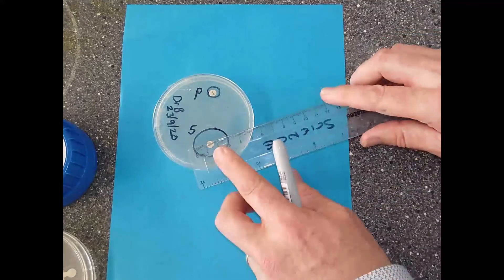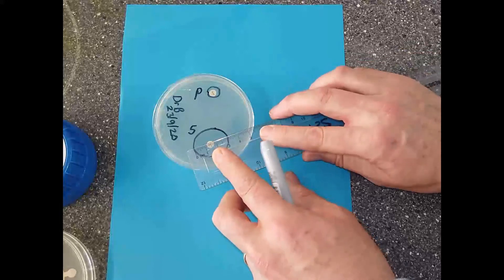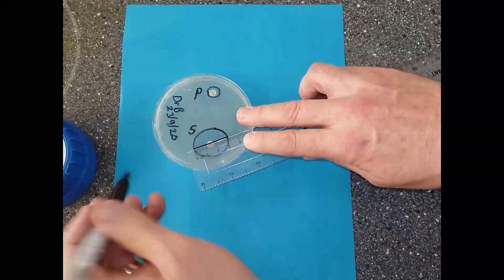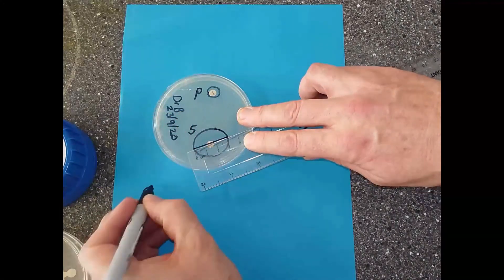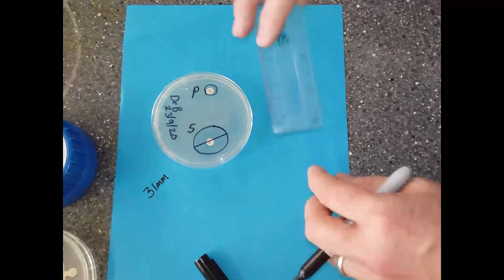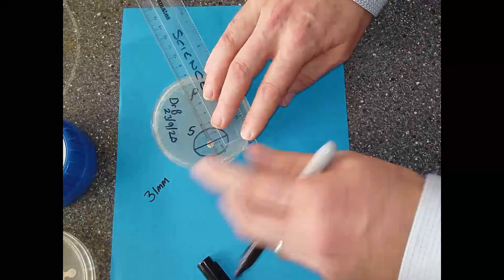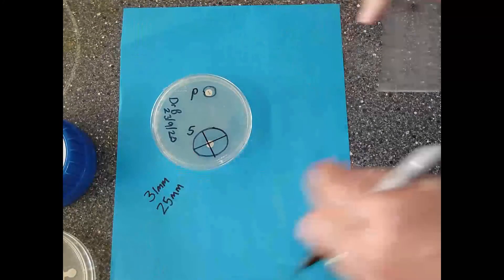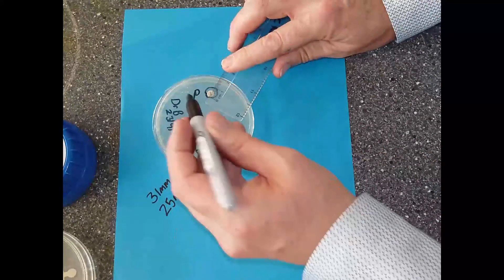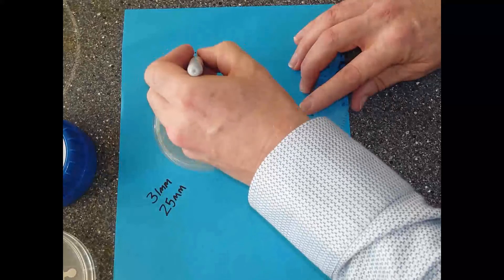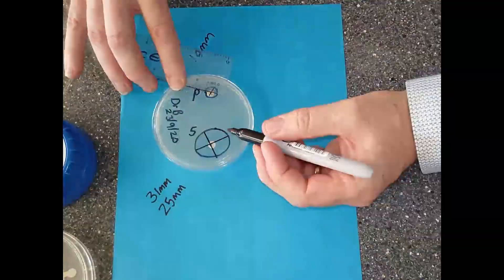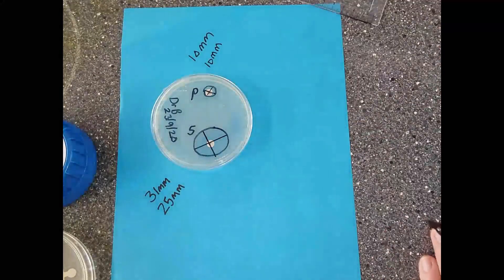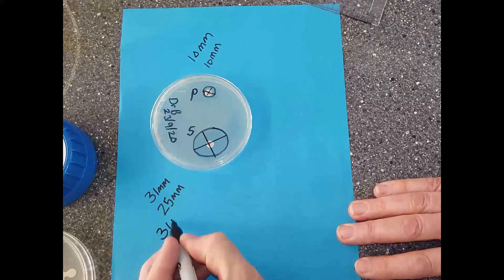We take a ruler and measure in millimeters the size or diameter of the circle. I'm going to measure streptomycin from there to there - that's 31 millimeters. Because it's not perfectly circular, I'm going to go from another direction across - that is 25 millimeters. I'll do the same for penicillin. Across there, that is 10 millimeters, and across the other way, that is 10 millimeters. We can now find the mean.